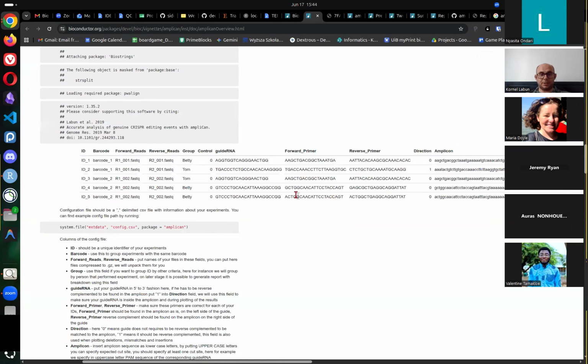config over here. See, this one is unique, this one is unique, and this one is unique. So just grabbing one of them is enough to know this belongs to this ID. Very often, reverse primers are a little bit botched, or maybe reverse reads are bad quality, and then it is difficult to quantify those primers.